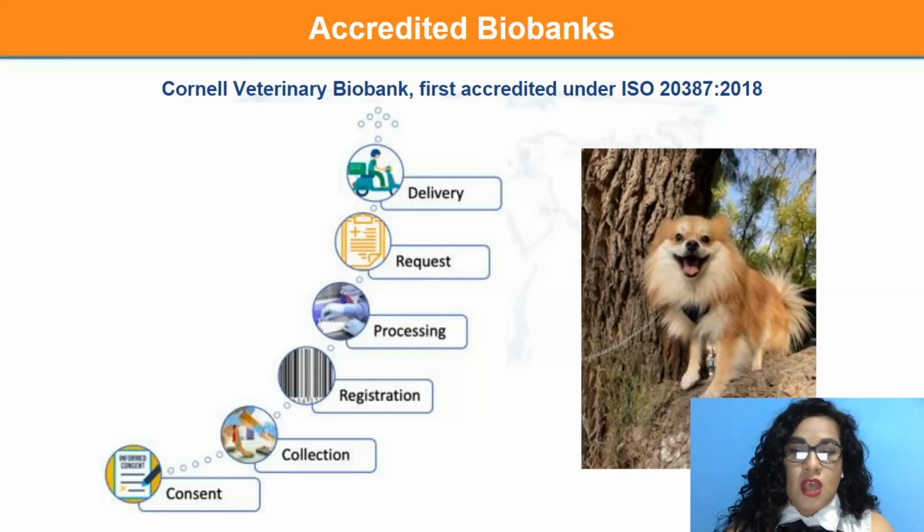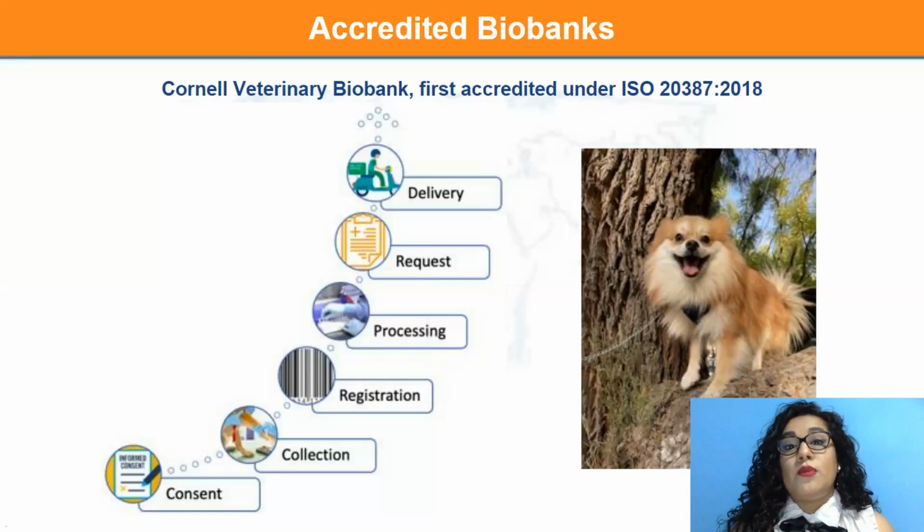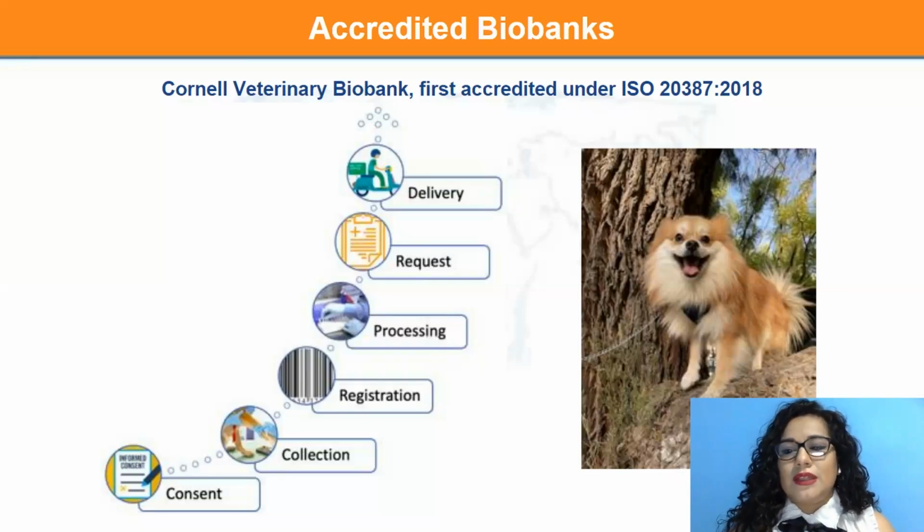So as you can see, quality management is essential in the maintenance and operation of the biobank. A biobank should be able to track each specimen, which helps to manage biospecimen quality and the effective use of the sample in the future. A good quality management plan can lead to higher quality biospecimens and reproducible research results. So pay attention to detail; each step of the workflow needs to be documented.